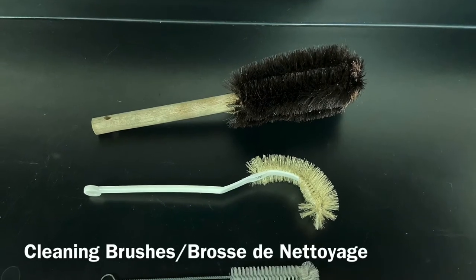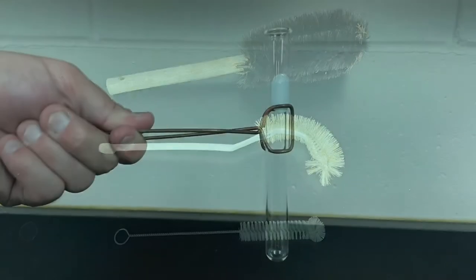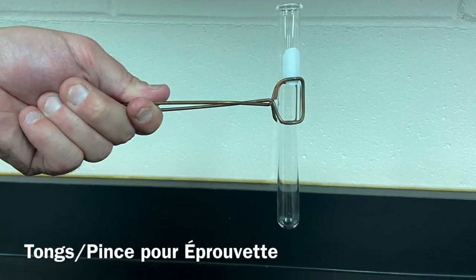Cleaning brushes. Brosse de nettoyage. Tongs. Pince pour éprouvette.